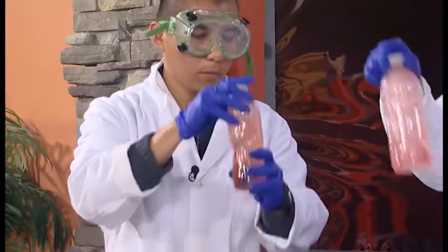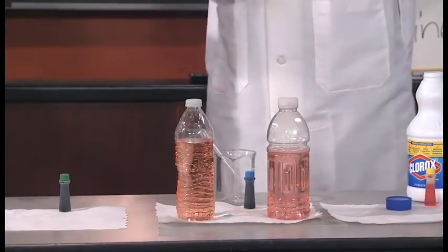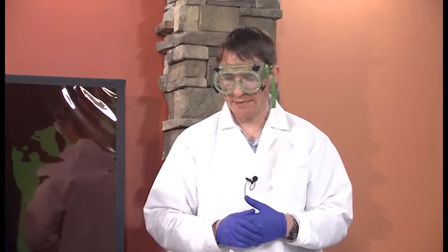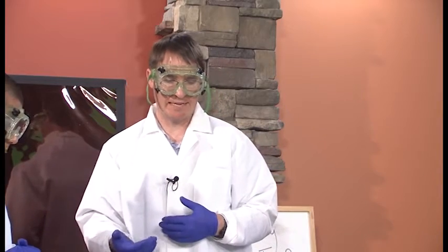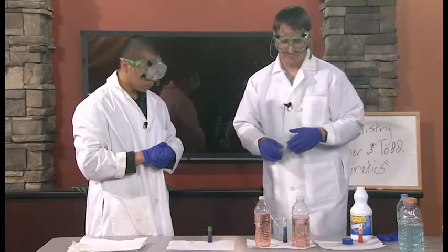And then set it back down. And then make some sort of observations as to what happens between the room temperature solution, room temperature reaction, and the much warmer reaction. So you predicted that the much warmer reaction would happen a lot faster, react much faster. So it should take less time to go colorless as opposed to the room temperature one.